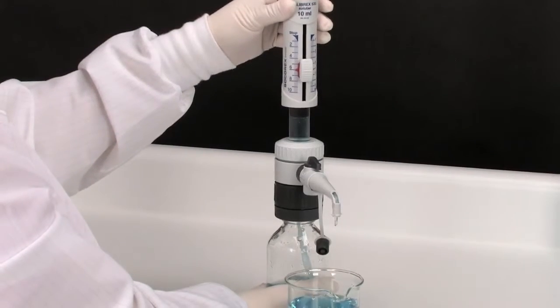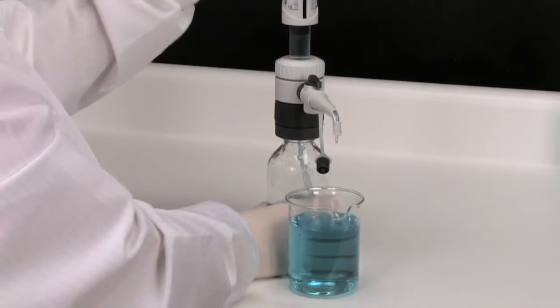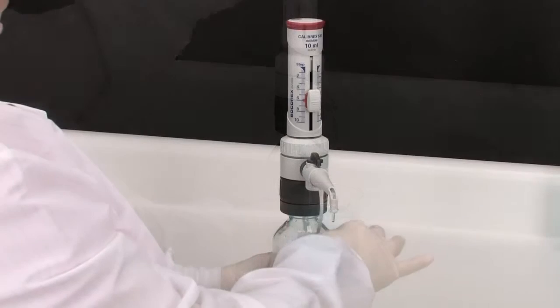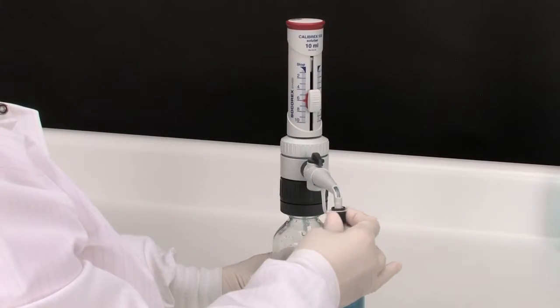The precision machined parts enable very soft dispensing movements. Reattach the screw stopper when dispensing is completed.